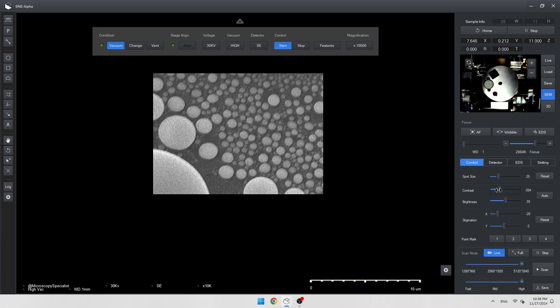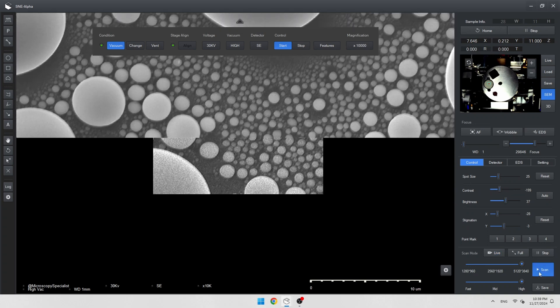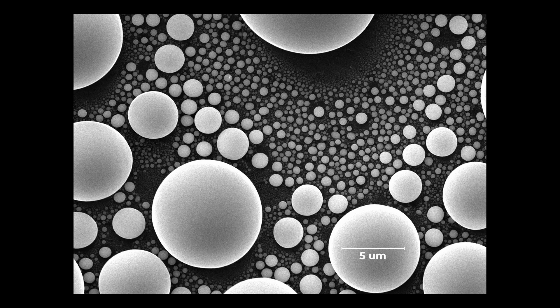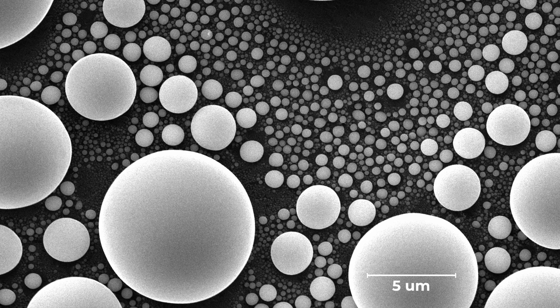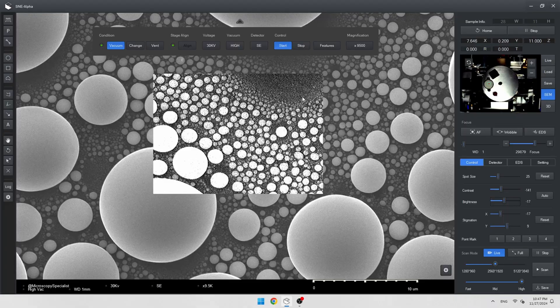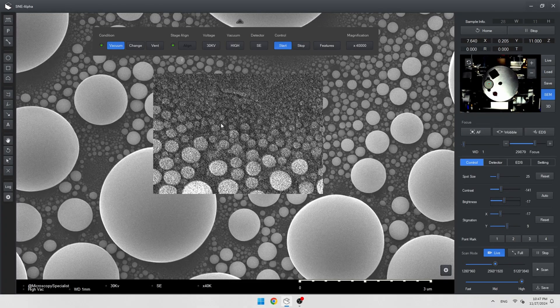Now we can finally adjust brightness and contrast and perform a scan. Let's try to squeeze out the maximum possible resolution.